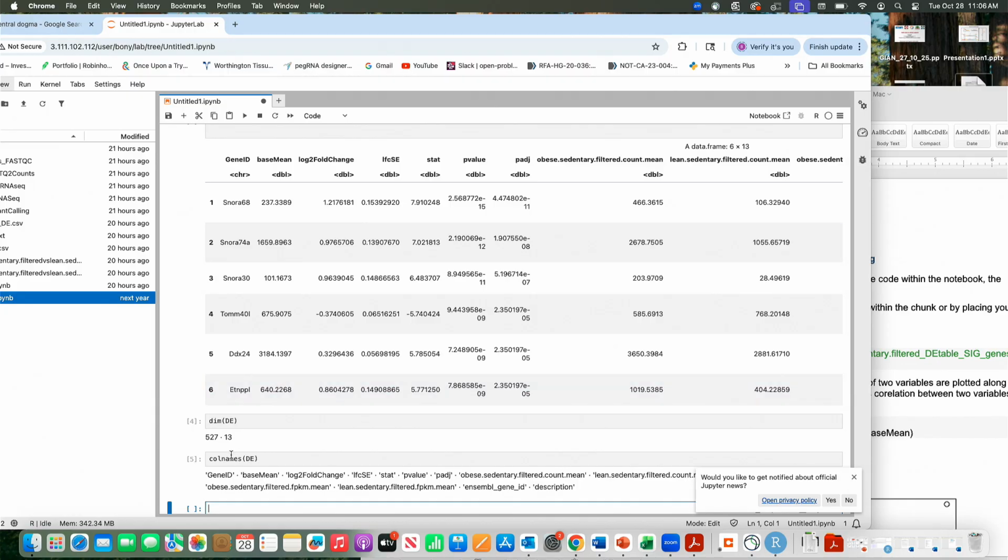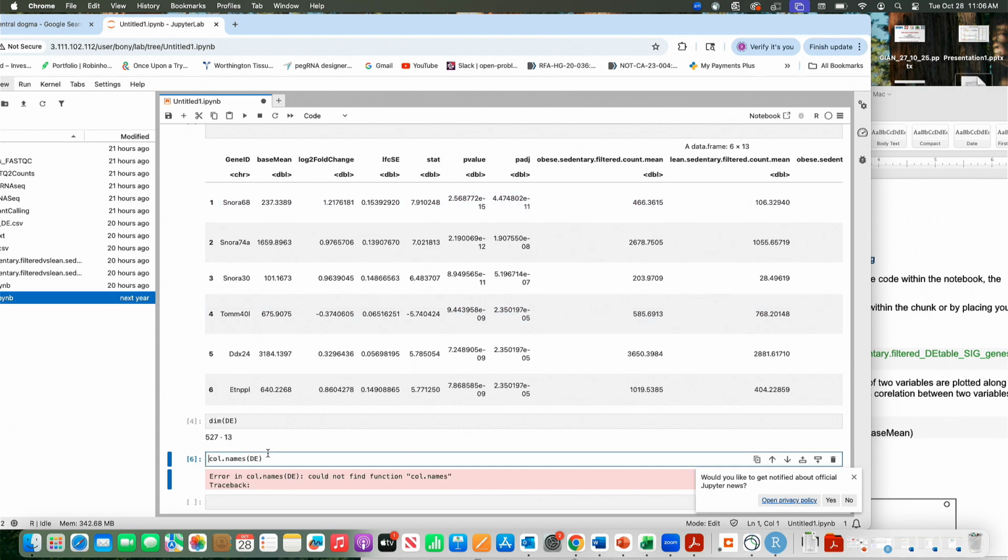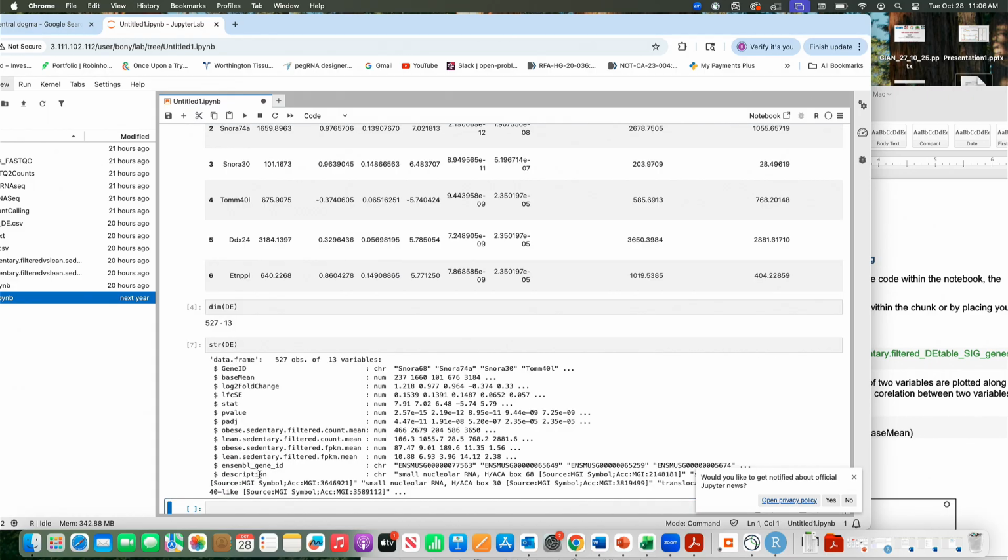Let me check what it is, but no, it is. So, you can use another command called str.